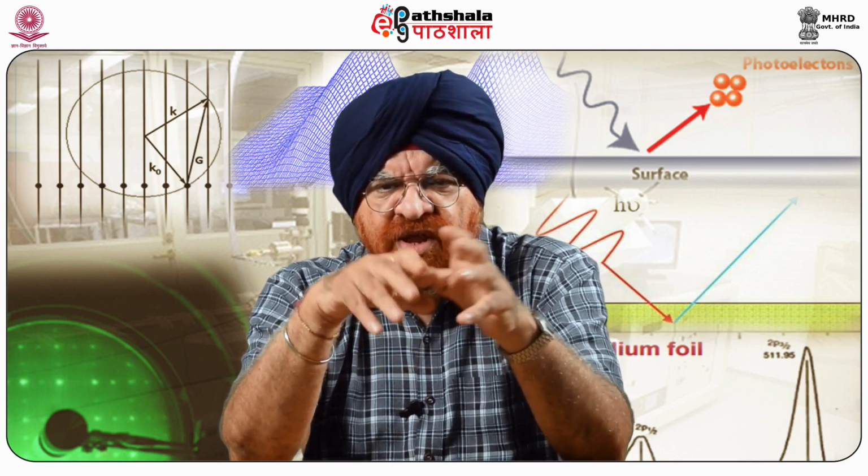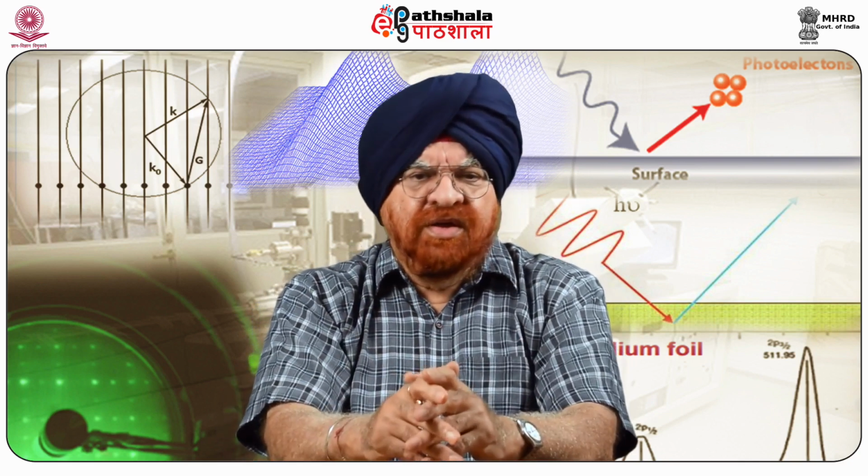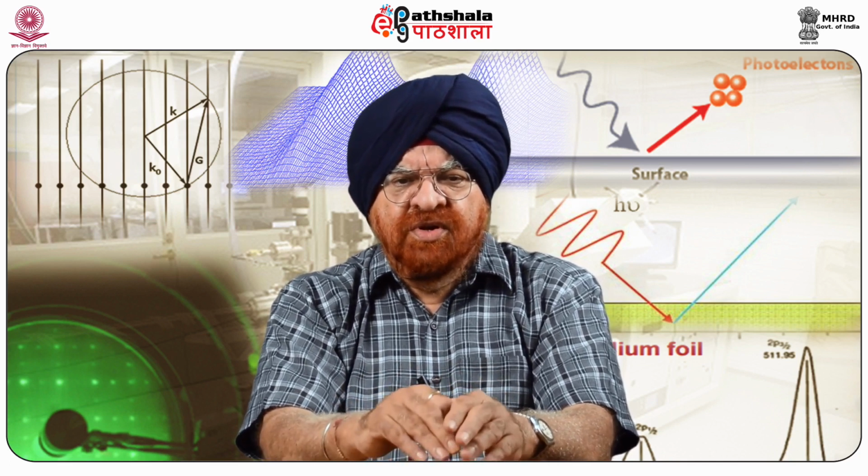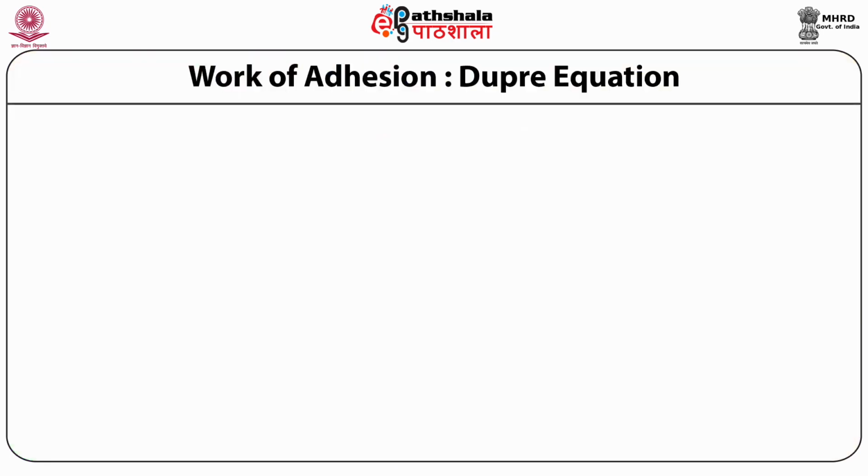In the case of adhesion force measurement, this can ensure the existence of flat terraces and forces that are free of interference from nearby steps. Before starting an adhesion force measurement, the supersaturated growth solution should be replaced by the working solution of lower supersaturation. Work of adhesion is given by the Dupré equation.